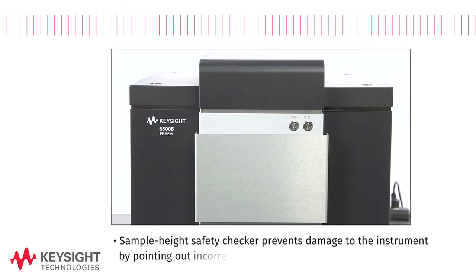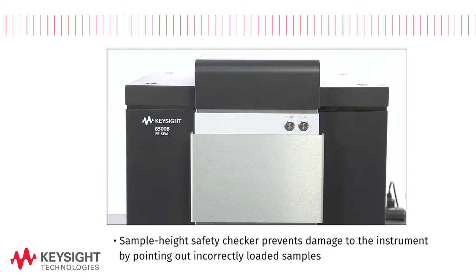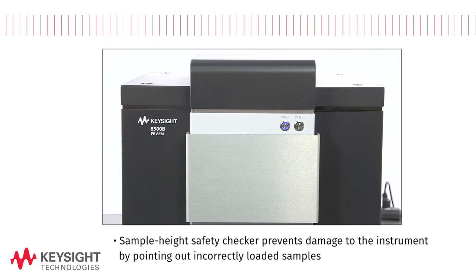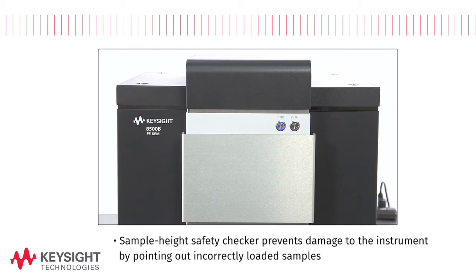A sample height safety checker helps prevent damage to the instrument by automatically pointing out any samples that have been incorrectly loaded.